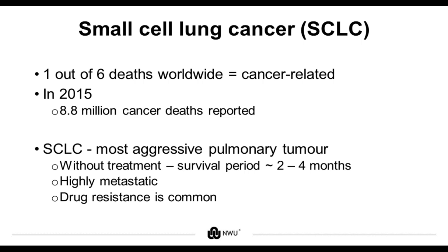As I've mentioned earlier, we are currently establishing 3-dimensional cell culture models for multi-drug resistant cancer research. Our main goal is to develop a research platform for multi-drug resistant small cell lung cancer. Seeing as approximately 1 out of 6 deaths worldwide are associated with cancer, it remains a devastating and serious health concern globally.